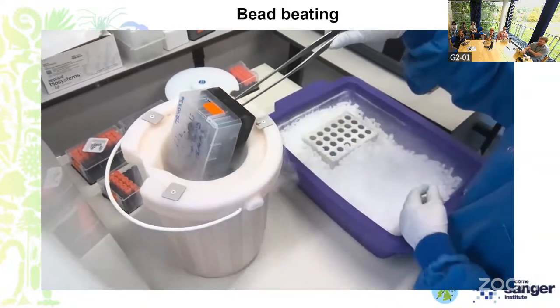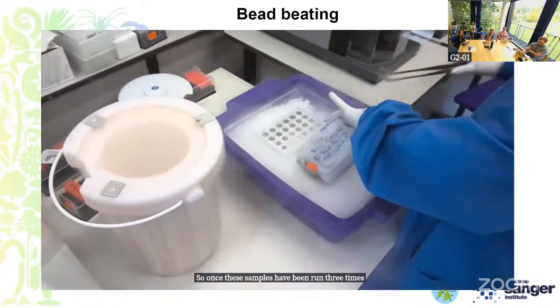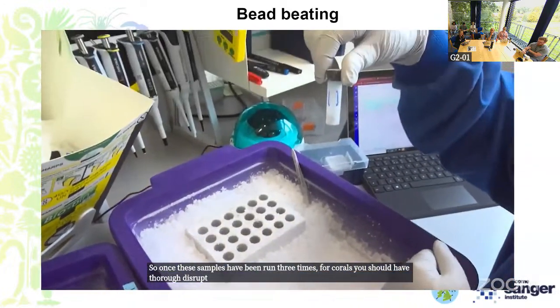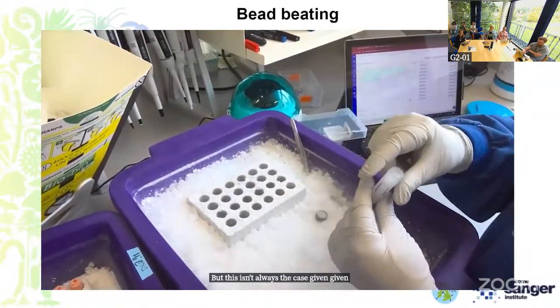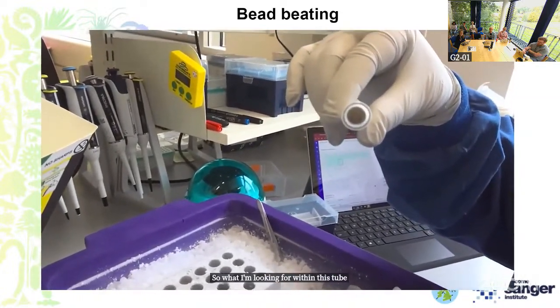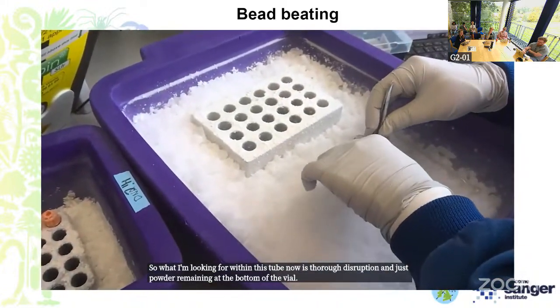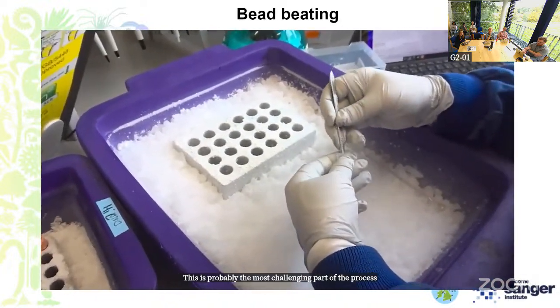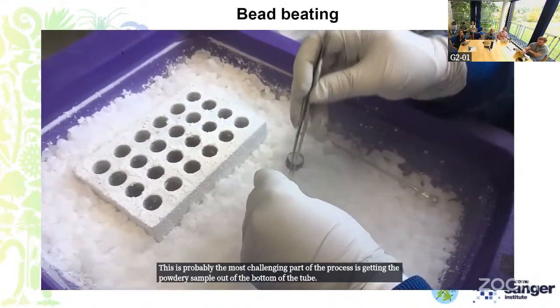So once these samples have been run 3 times, for corals, you should have thorough disruption completed, but this isn't always the case given the nature of the species. So what I'm looking for within this tube now is thorough disruption and just powder remaining at the bottom of the vial. This is probably the most challenging part of the process, is getting the powderized sample out of the bottom of the tube back onto the weighing boat.